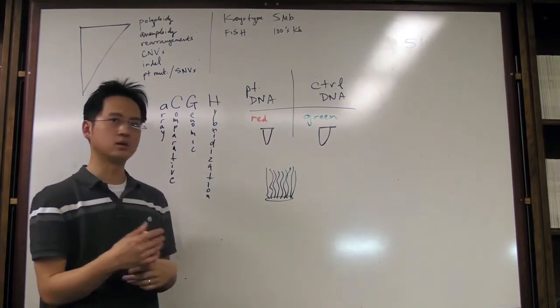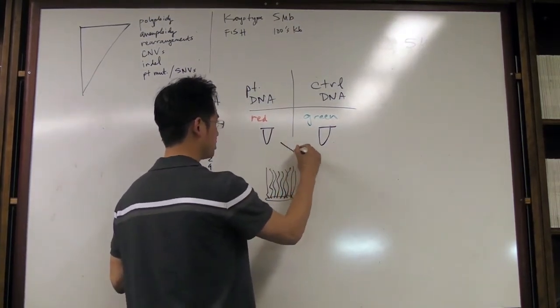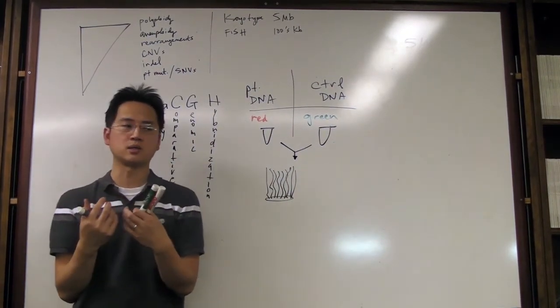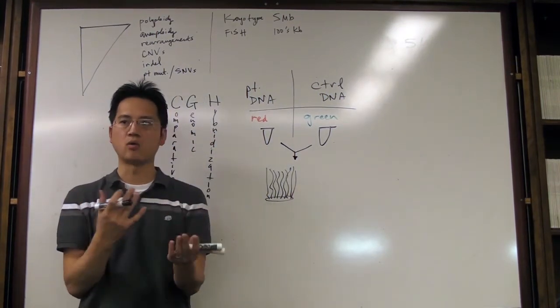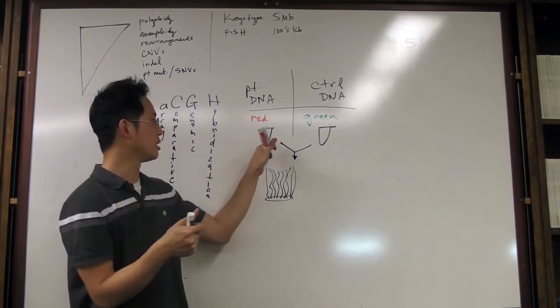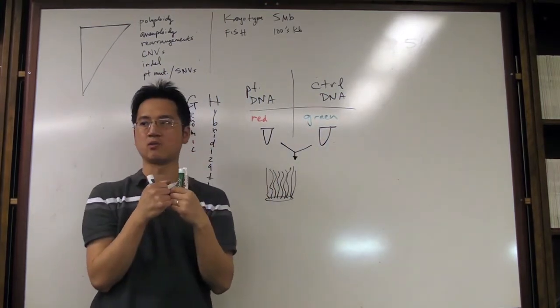So after labeling, you're going to do some cleaning process, and you're going to mix them together. You mix the two samples together. Hopefully, you have already done an upfront step to normalize the two samples. Typically, we like to do Qubit analysis so that you're quantitating equal amounts of double-strand DNA between the two samples. Put in 1 microgram of each sample during the labeling, and then after labeling, after cleaning up, you're going to combine the two samples together and mix them.